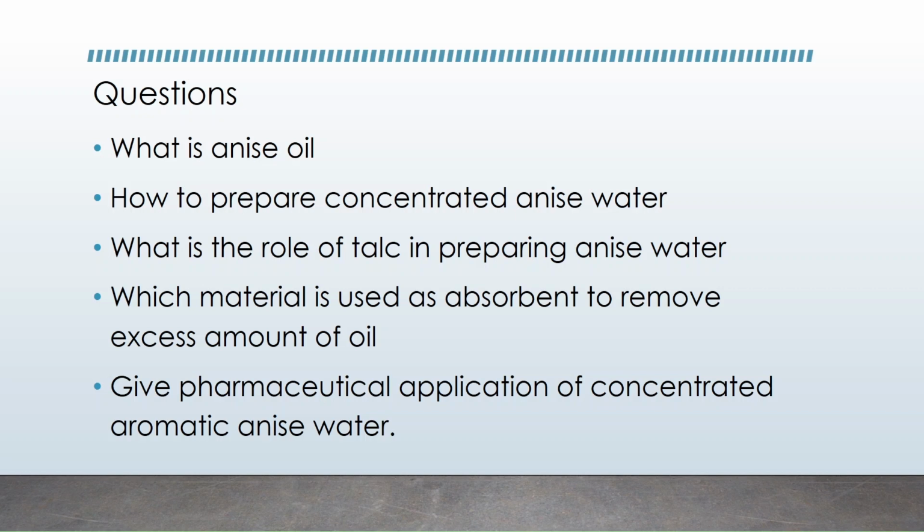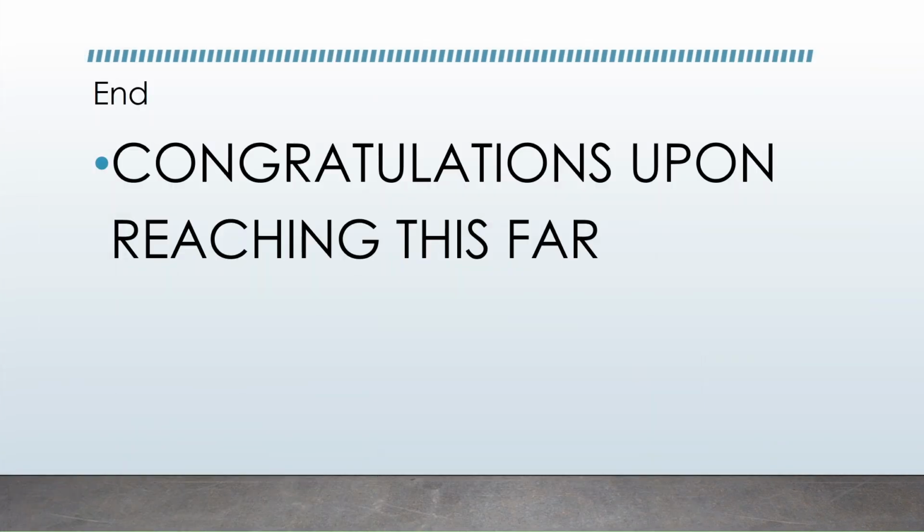Which material is used as adsorbent to remove excess amount of oil? Which material is used as an excipient? Which reagent? We can call it reagent. Which material do you use as adsorbent to remove excess amount of oil? And then give pharmaceutical applications of concentrated aromatic anise water.